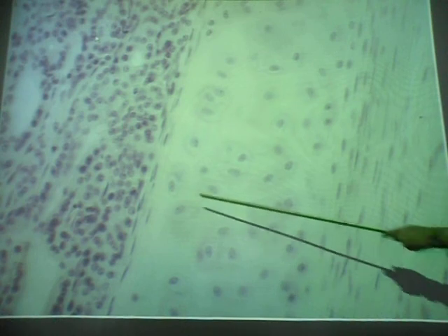And you remember too, that in bone formation, with endochondral or cartilage bone, one of the first things that happens is you get a bony collar around the cartilage. What that does is shut off diffusion of oxygen and nutrients to those cells. They die, the cartilage erodes, and is replaced by bone. So again, this is hyaline cartilage, which serves to support the wall of the trachea. As I said, all the cartilage in the respiratory passages is hyaline cartilage with one exception. And which one is that? It's the epiglottis, and that's elastic cartilage.